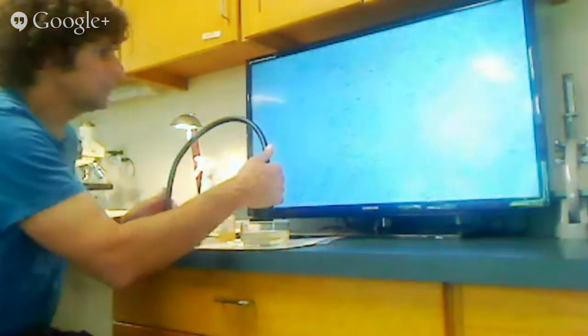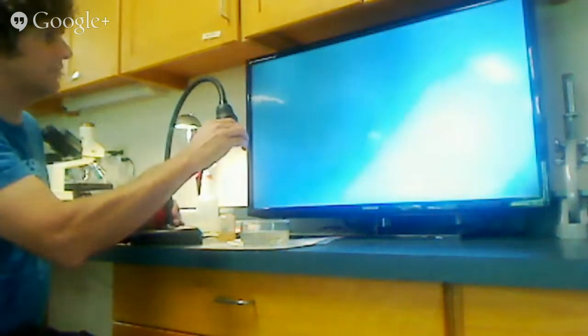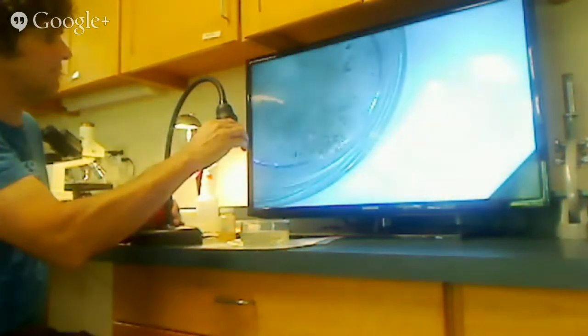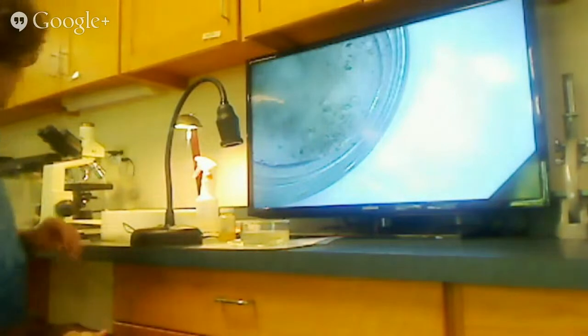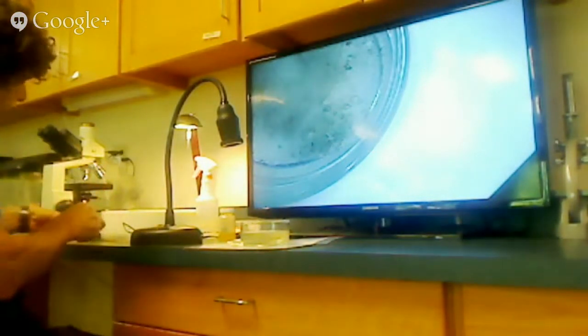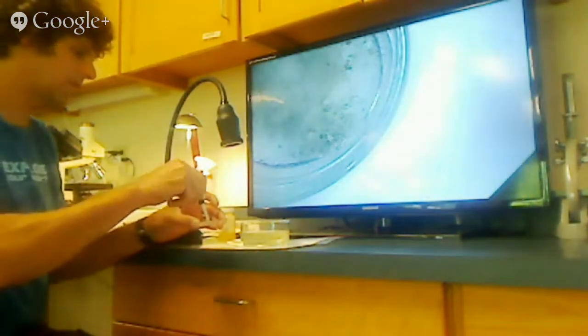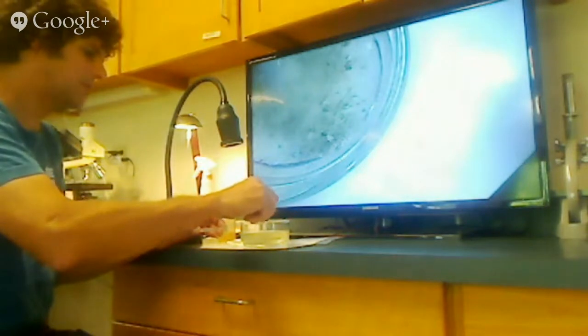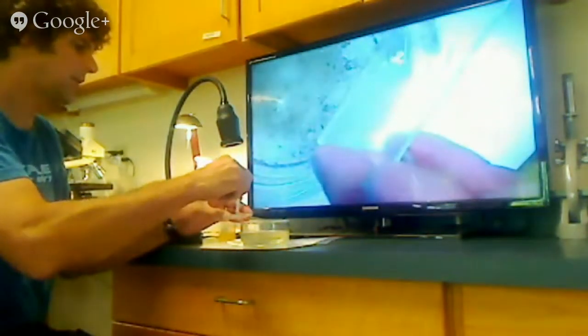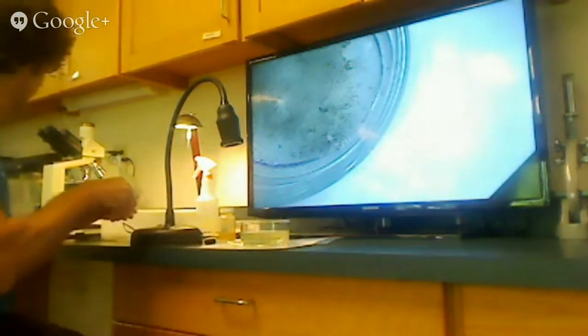And so we're going to jump over now to, instead of looking at our sample at the macro scale right now, I'm going to refresh our slide and then set up the microscope to show you what kinds of life we have and what these things really end up looking like, and it's quite remarkable.